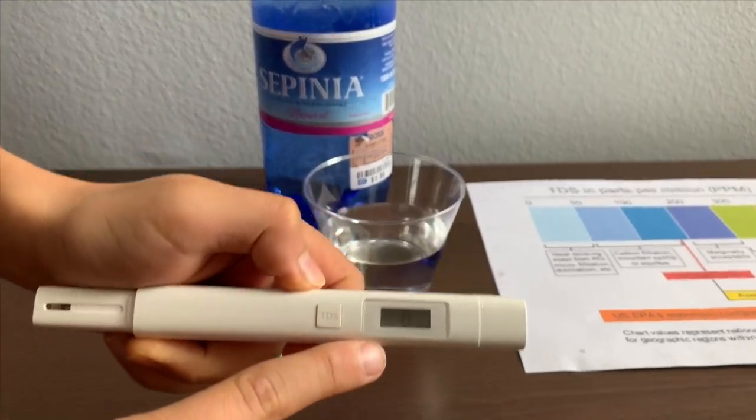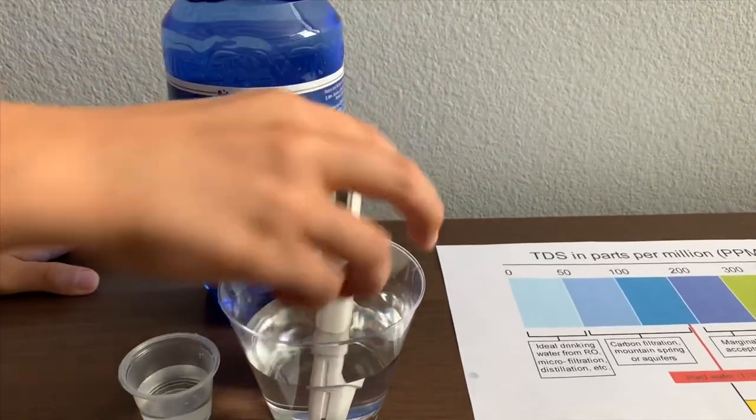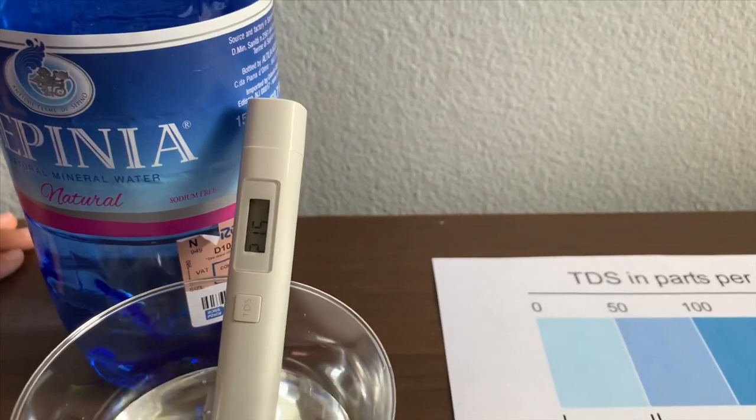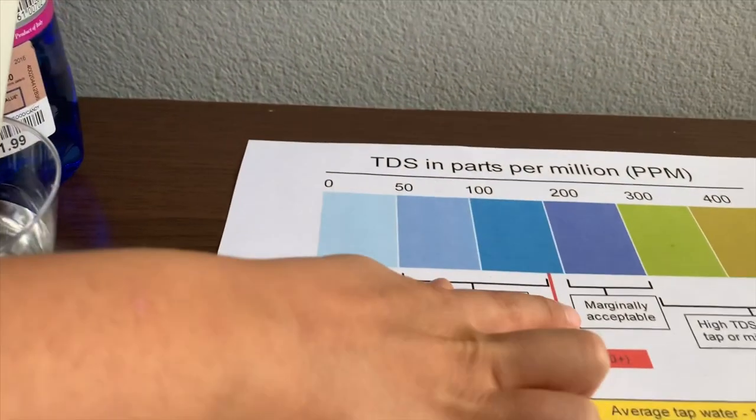Turn on the TDS tester, make sure it says zero, and put it in — 215. That is marginally acceptable.